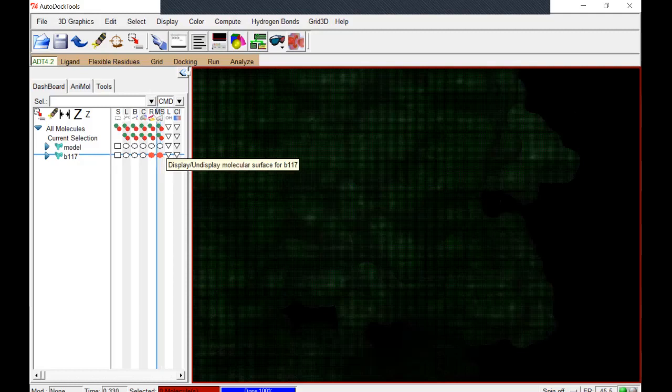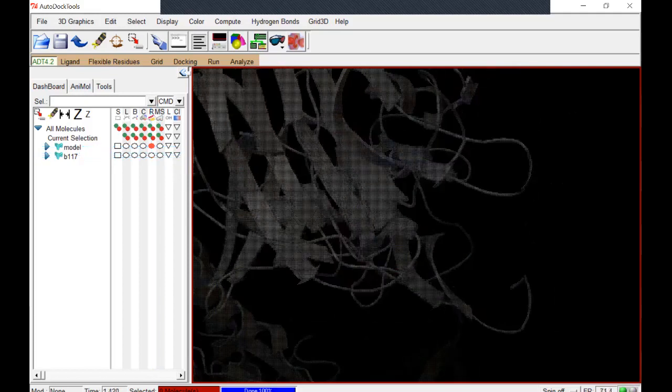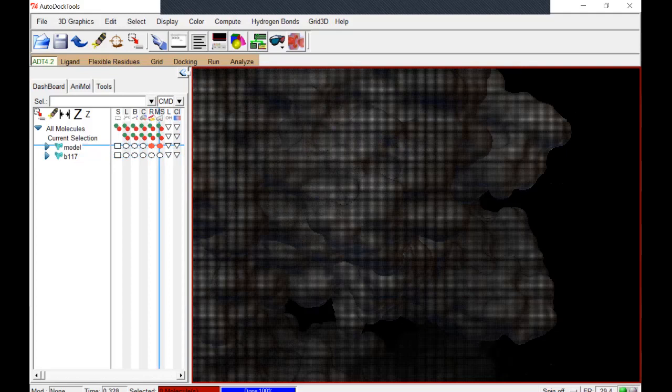All right, now if I turn that off and turn on the loop for the base model, the base model goes down a little bit. It kind of curls a little bit. And with that, you have the space that it's occupying.